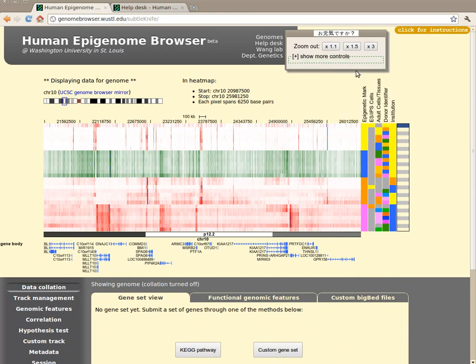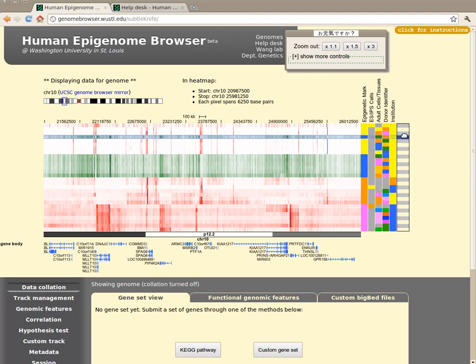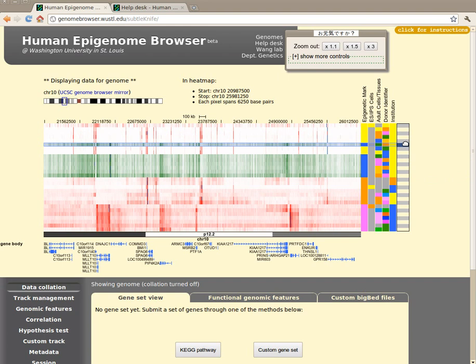And the last way to configure the heatmap display is to rearrange the tracks. There is an image with stripes, like zebra stripes, on the right of the metadata area. You can click and drag it on one. It's not so evident. Let me click on this one. So this track will be rearranged. This is a way to rearrange only one track at a time.